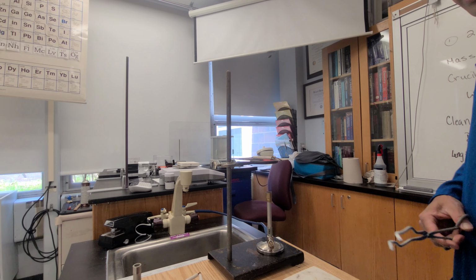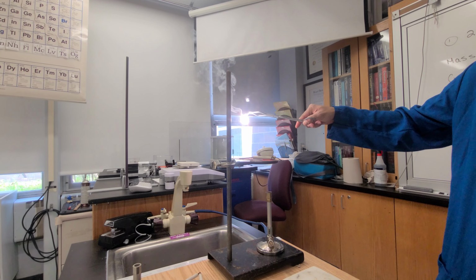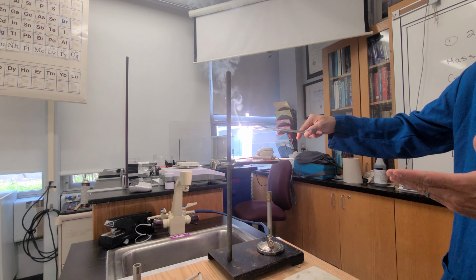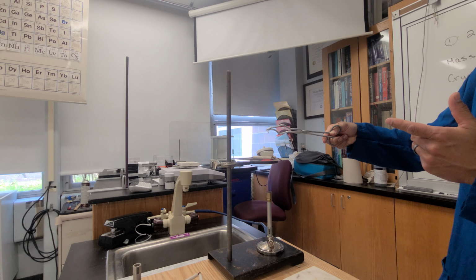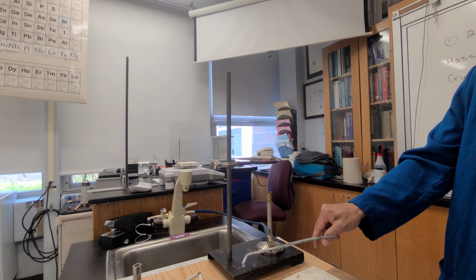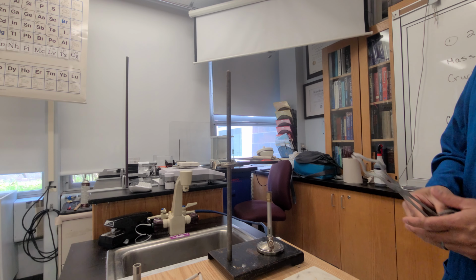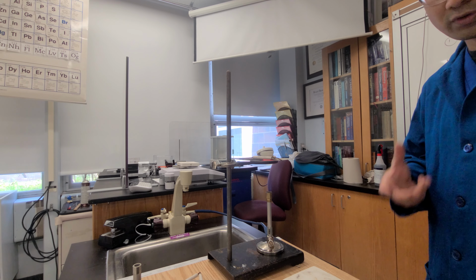For those who would like to see what the magnesium looks like, here's a little strip, and I'm just going to light that up. So that's what that looks like. Essentially, that's what we're going to be creating. And this white powder, right? That's the magnesium oxide, and we notice that it goes from an extremely regular, flexible metal to a very brittle powder.